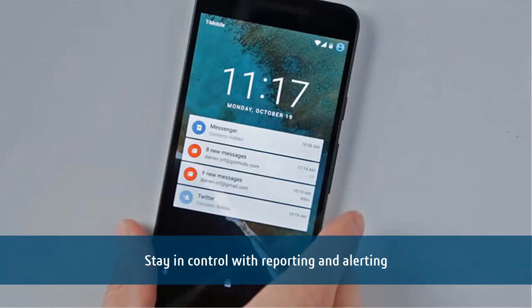You keep in control of your data, and you can still copy your run if you want to reanalyze it using other parameters, etc. So all the functionalities that are there in Assay before Autopilot are still there even with an Autopilot run. And the good thing is, as I mentioned, you keep a trace of who somehow went against the machine.